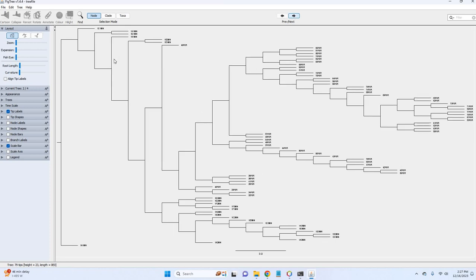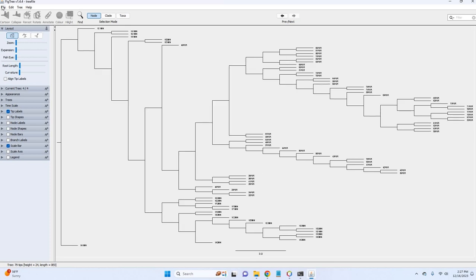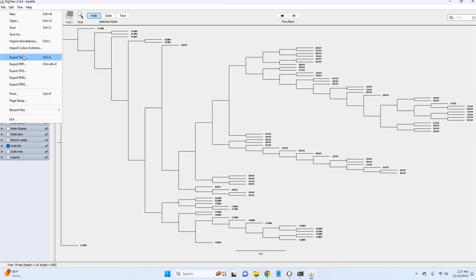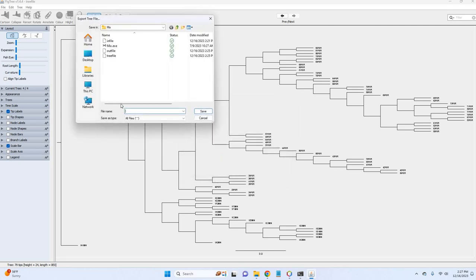As I step through, the variation is minuscule, just placement within the major clade, no switching sides. The same thing for tree number 3 and tree number 4. Since the NCBI viewer only accepts the Newick format, I will extract this one and just call it Newick.